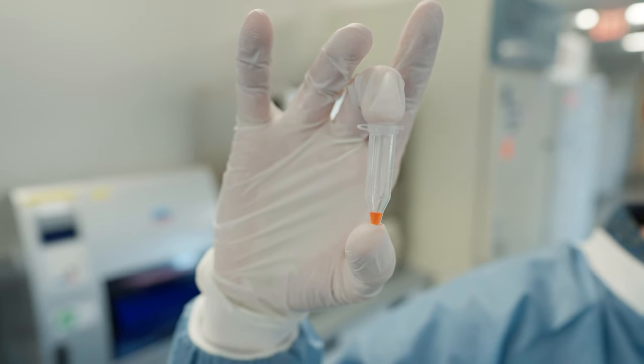Once the robots are completed with the extraction process, the sample is then eluded in about 50 microliters of sample, about the equivalent of a raindrop.